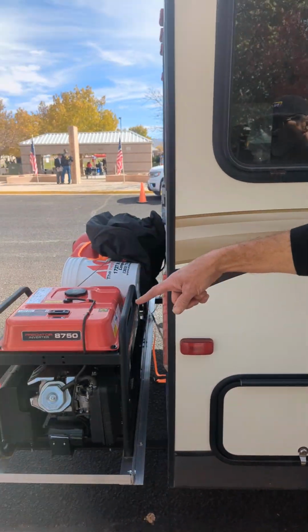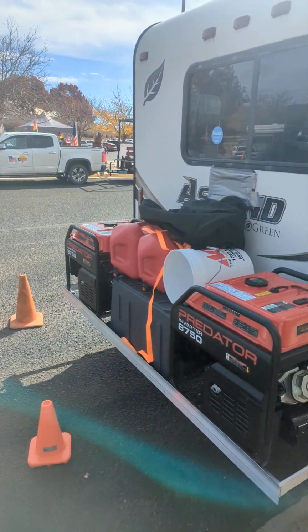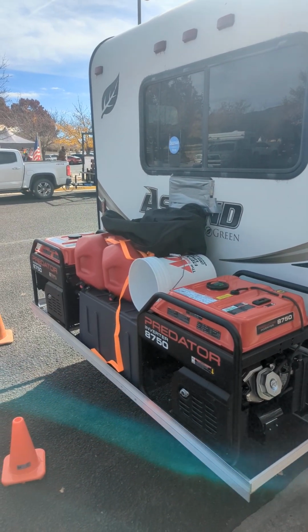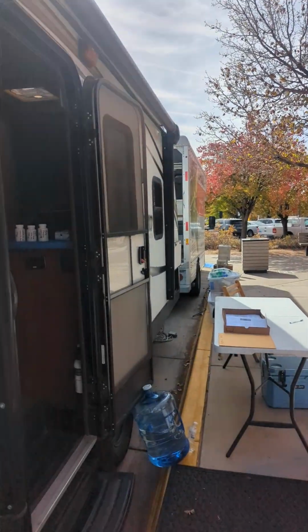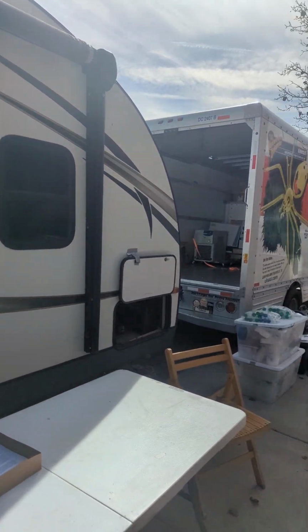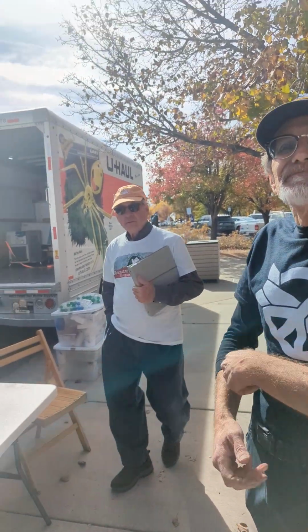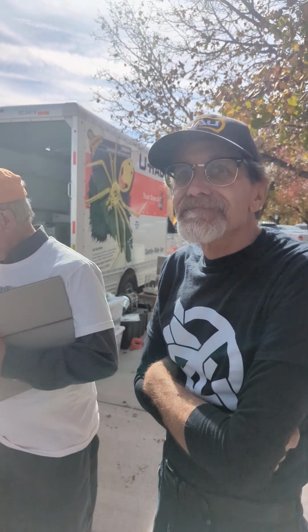If you look over here, we can run this probably for about 20 hours with the supplies we have on board. These generators will power all the electrical items for it. And the rest of the trailer has been outfitted essentially to contain this laboratory, the chemistry supplies, and so on. So you've done this on your own with help from citizens. Yep. To find out what is really going on with radiation in New Mexico and across the nation, huh?